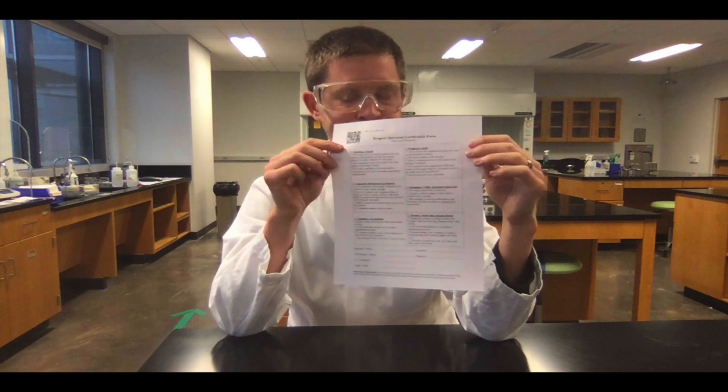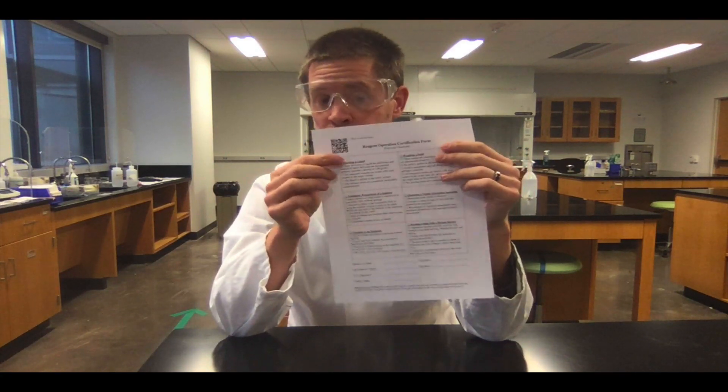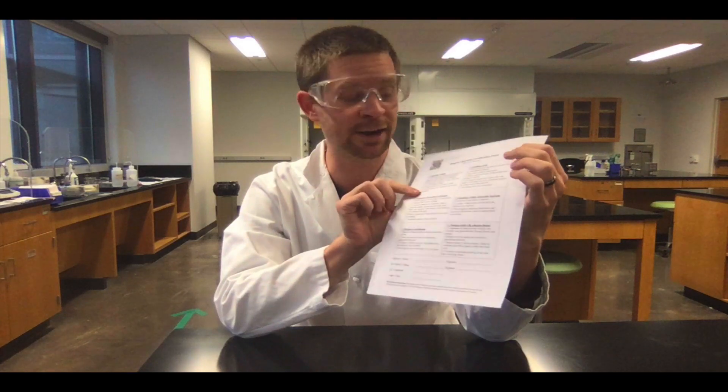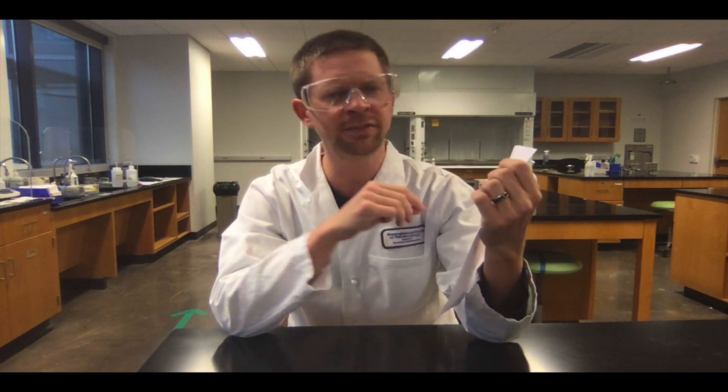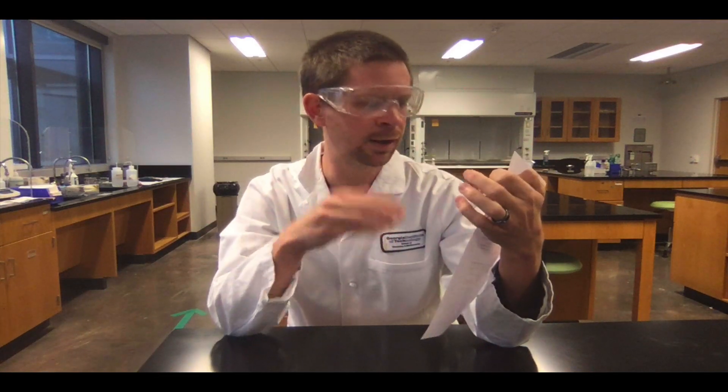The next step is to carry out the operation under observation of your lab partner. As you do this, it's important for you to understand what's on these checkboxes so that you carry out the operation according to specifications. There are things like operating safely and with good technique, without contamination, without spills. For operations where you're measuring out a chemical, transferring a liquid via pipette or weighing out a solid, if there's a target to hit, hitting that target is an important checkbox within a certain percentage. Typically plus or minus 5% is pretty typical.